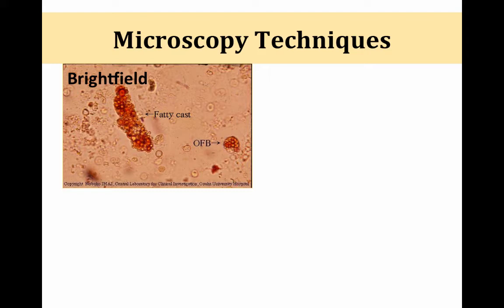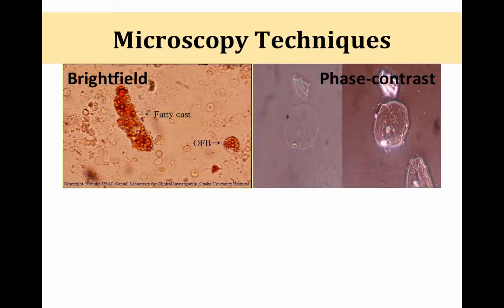The catch is that things that are generally transparent or translucent, like a hyaline cast or mucus thread, unless you have the light setting correct, it's going to be hard to visualize. So it is commonly used, but it does have its downfalls. It's better when you're looking at a stained specimen, in this case, using bright field microscopy.